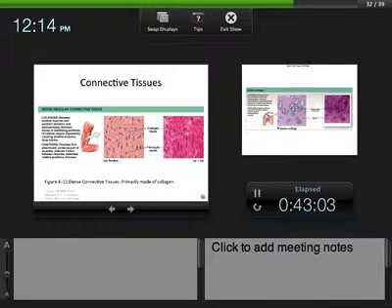Everything, all the fiber is lined up next to one another. Mostly collagen, really strong along the axis of the fibers. Not so strong perpendicular to it.